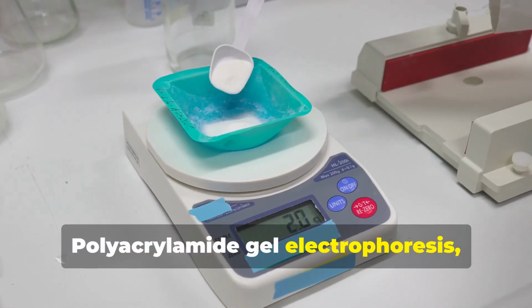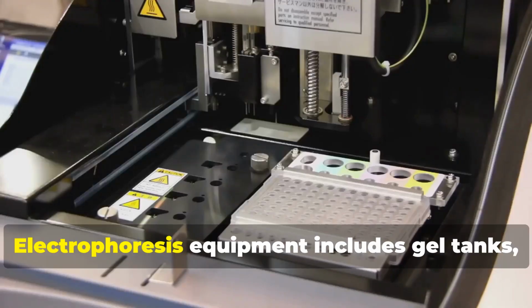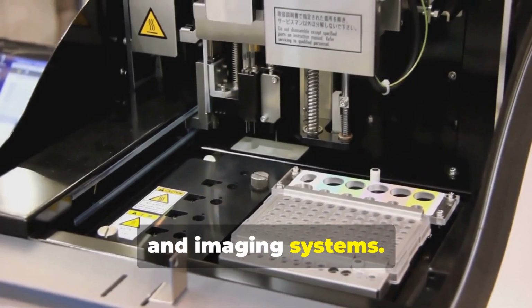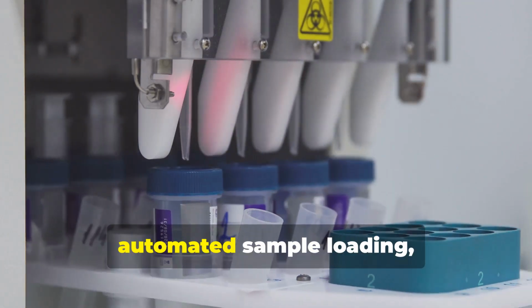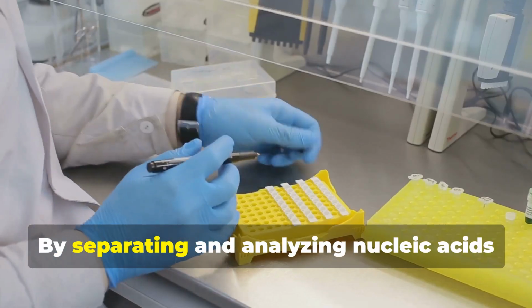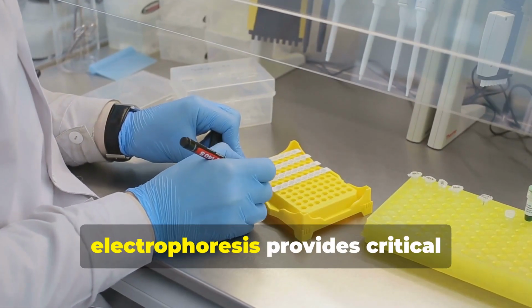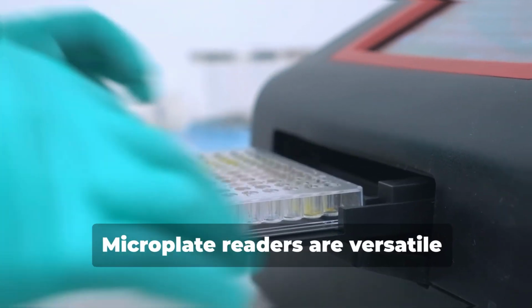Polyacrylamide gel electrophoresis, or PAGE, is used for separating proteins. Electrophoresis equipment includes gel tanks, power supplies, and imaging systems. Modern systems offer features like temperature control, automated sample loading, and high-throughput capabilities. By separating and analyzing nucleic acids and proteins, electrophoresis provides critical insights into molecular biology.